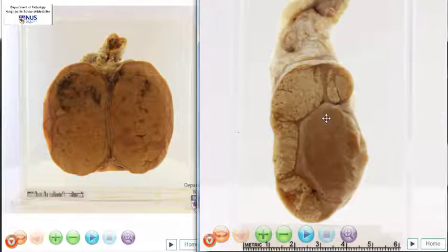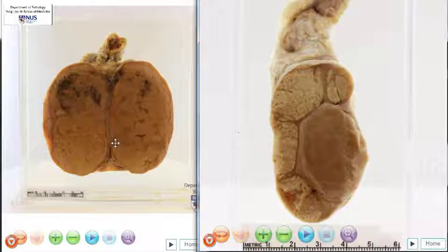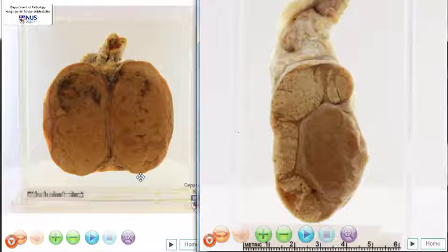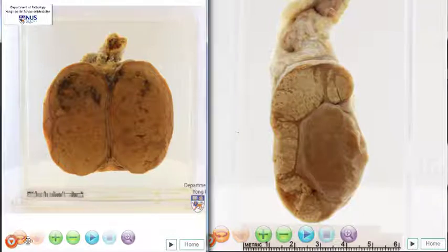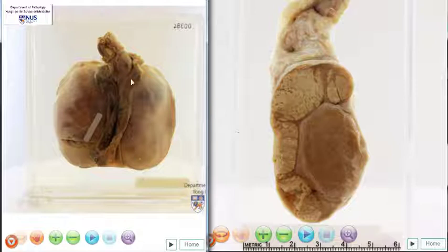So this is an example of TB involving the epididymis, as contrasted with a primary germ cell testicular tumour, which causes pretty much homogeneous expansion of the testis by this lobulated, fleshy, tan-brown tumour mass. And in this case, the epididymis here still appears grossly normal.